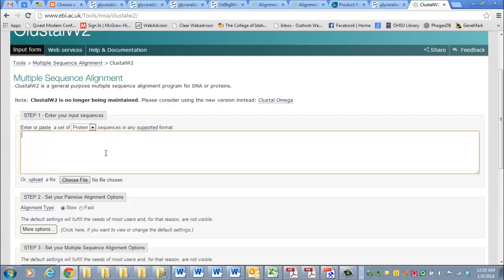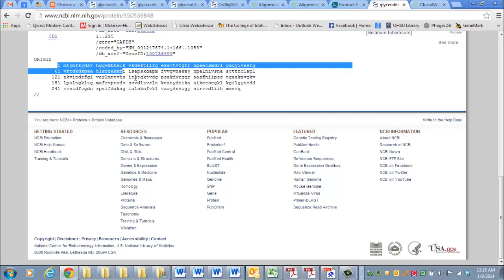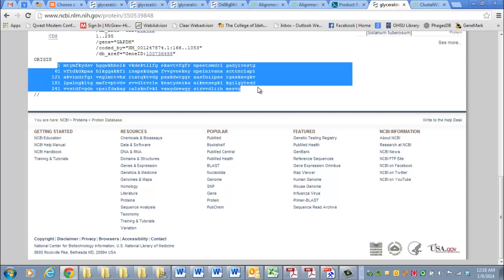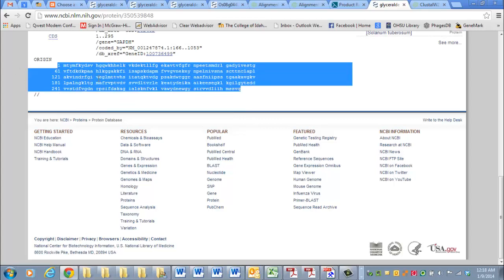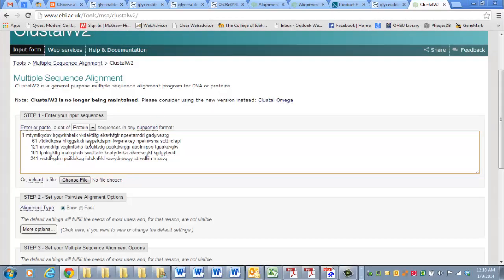The only trick here is after you paste the sequence in, it doesn't matter if you include these numbers on the side, that's okay. But we're going to copy this and paste it over here. It looks kind of ugly, but that's okay.